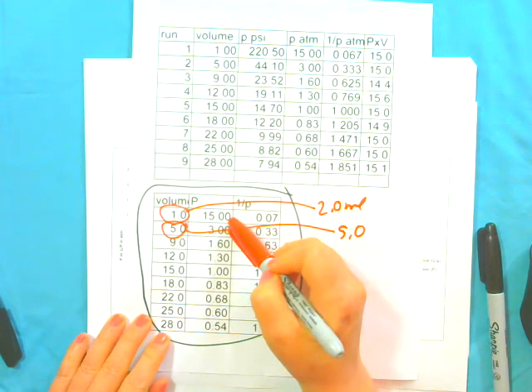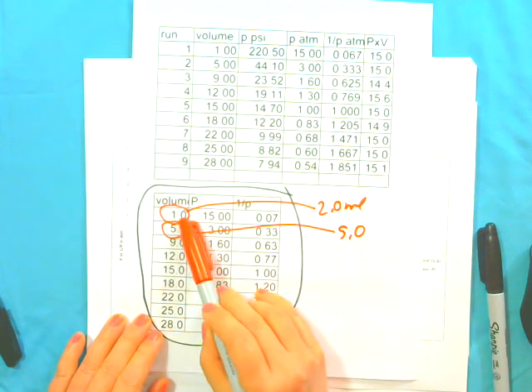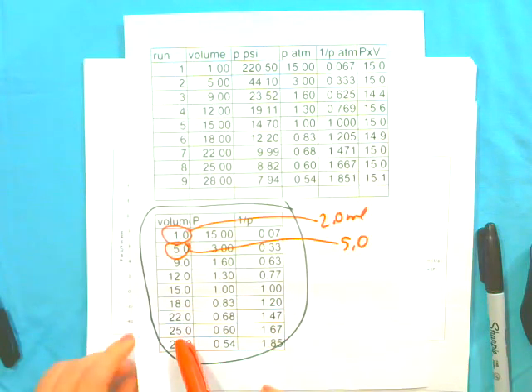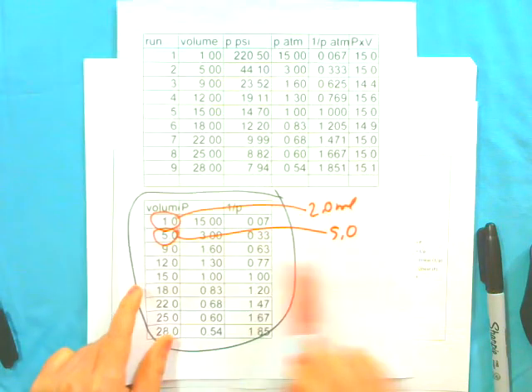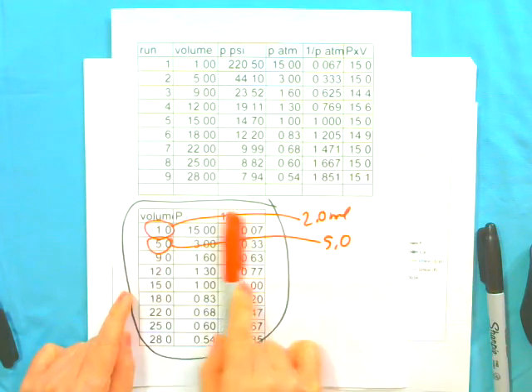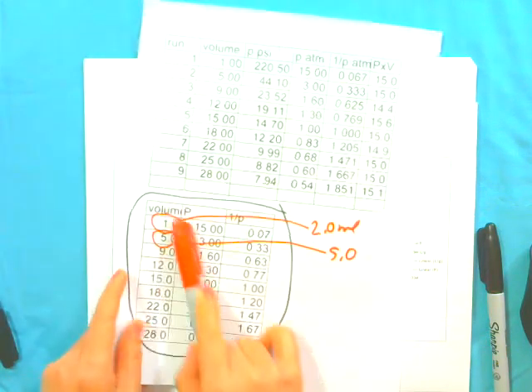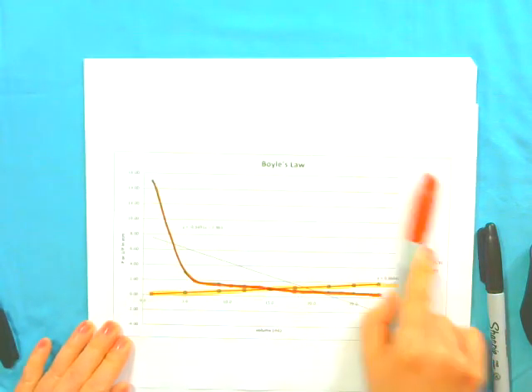Where you have pressure, you're going to put in your own data. You can just go ahead and do that. And what you will find is that when you put your own data into my chart, this plot will actually change to match whatever data you input here. So what that means is you don't have to figure out how to do the select, insert, scatter plot and all of that. Instead, you can just insert your own data into the chart, plot out this plot, and there you are.